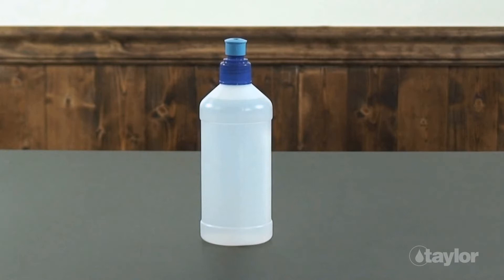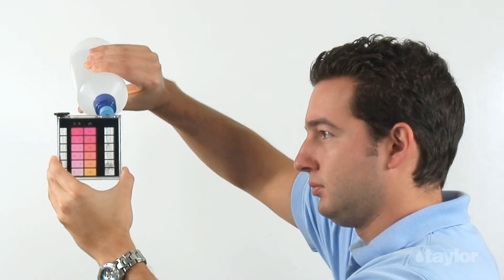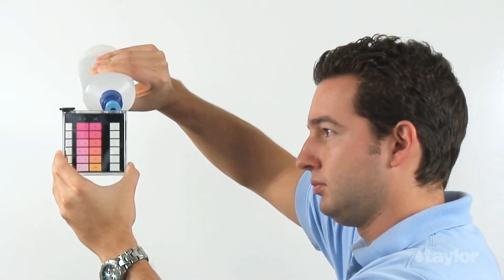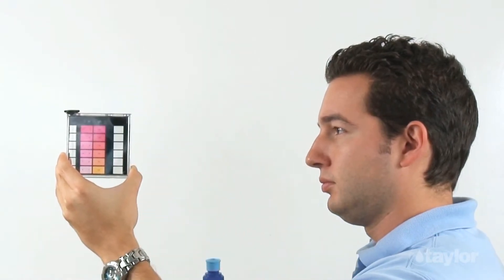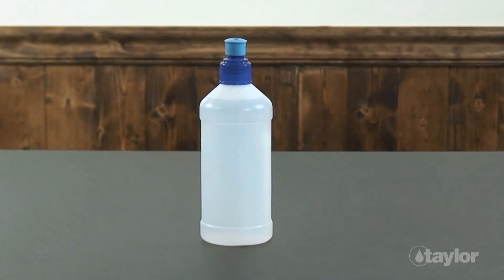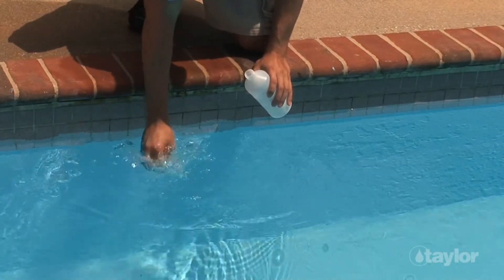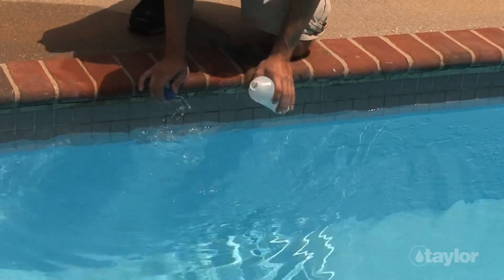You'll need at least 8 ounces or 250 milliliters of water. If you decide to use a sample bottle, choose one made of plastic for safety's sake. Pool supply stores often have inexpensive sample bottles with special dispenser caps that are very handy. Sometimes they give them to customers for free.